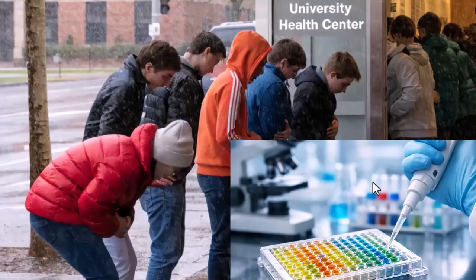Why? First, you prepare sample from leftover dressing and the chicken, then add them to a microplate pre-coated with toxin-specific antibodies. Second, if toxin is present, it binds. After washing, you add an enzyme-linked antibody. Third, you add substrate. A color change means toxin is present.